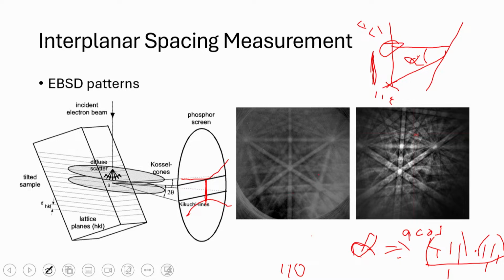It's a projection that's distorting. So he would get a projection of those spheres that would go like this. And then if you take the major axis of those ellipses, they're all going to intersect at the pattern center position. So that's kind of educational as far as how the projection goes and distorts the pattern along an axis pointing away from the pattern center.